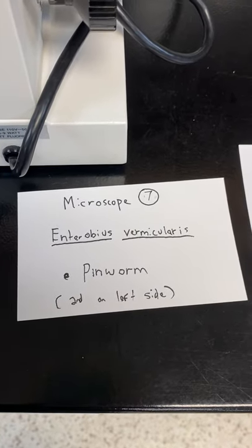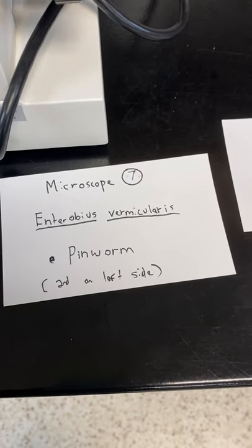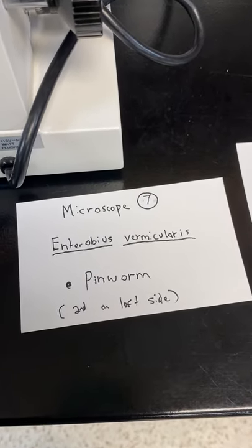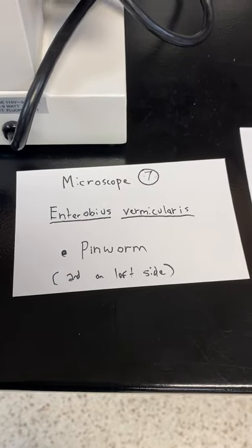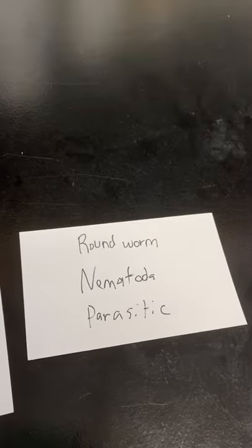Microscope seven: this is the human pinworm. It looks a lot like the schistosome, so this is on the left hand side — it's the second one down from the top. It's a roundworm, Nematoda, and it's parasitic. I was trying to move the slide so you can see the rest of the body but I can't get the focus and move at the same time.